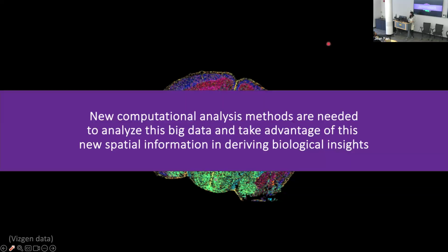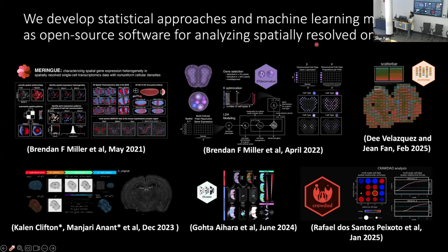So again, many different technologies, many of which have now commercial entities and platforms, making them more accessible. But of course, all of these tools or technologies, they make these measurements, but we really need computational analysis to actually make sense of all this big data and take advantage of the spatial information. So that's what my lab has been focusing on.